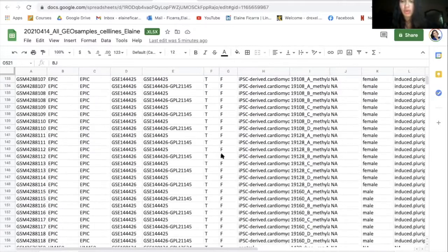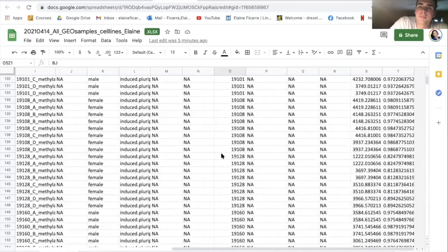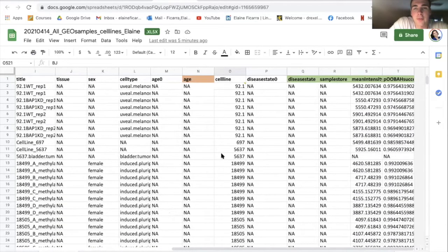He told me to organize the spreadsheet, find the characterized cell lines, and then implement the geo data, the VAF to the geo data. Okay. Do you want to do this in a faster way? Is this file on HPC? Probably. Okay, then let's go find it. Can you connect to HPC?